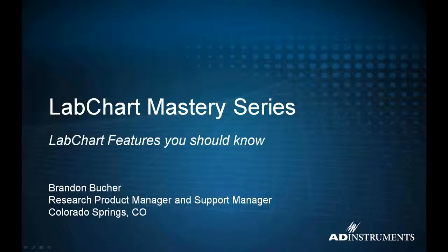What we started off with, the idea behind this, is that I realize there's a lot of things in LabChart that people really only get to see when some really specific question comes up. There's a lot of features in LabChart that we built in over the years. This software has been in development for over 20 years. So there's a lot of things that we put in here that were meant to solve a small problem, or were meant to be a really cool feature, and sort of get lost in some of the teaching that we do when we go over some of the larger features in LabChart.